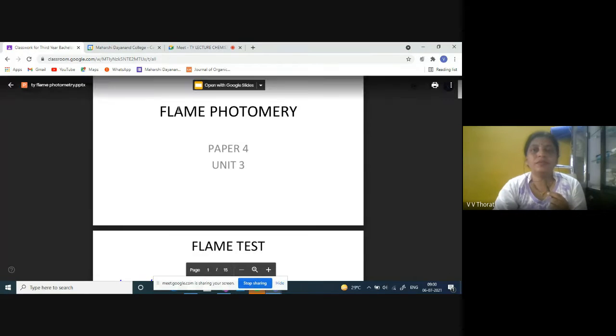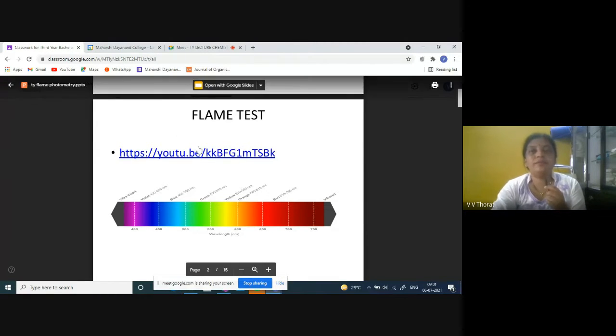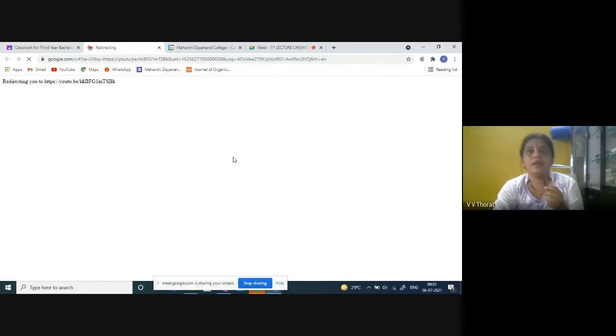Practical Unit 3: Flame Photometry. Flame photometry is based on the flame test which we used to do in FYBSc. From the color of the flame, we used to identify the elements present. So I'll start the video.